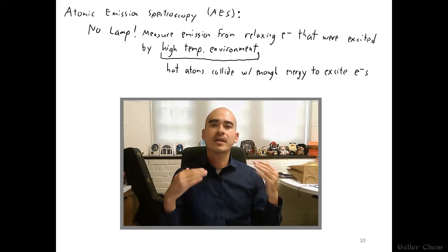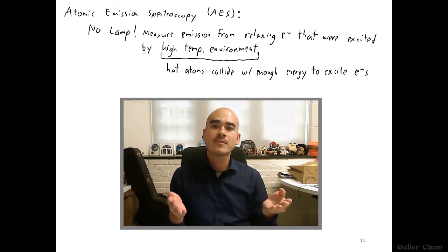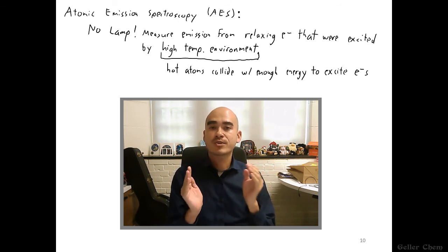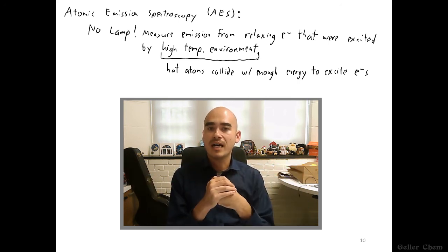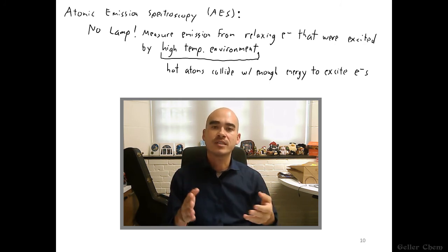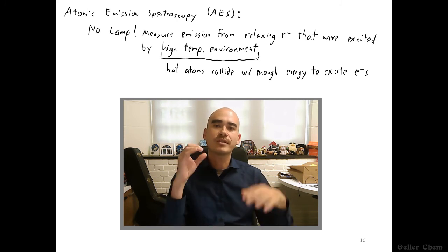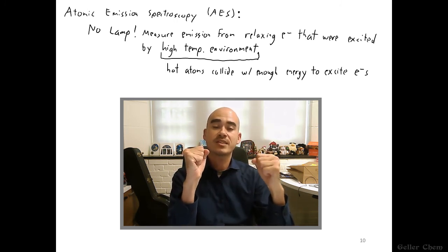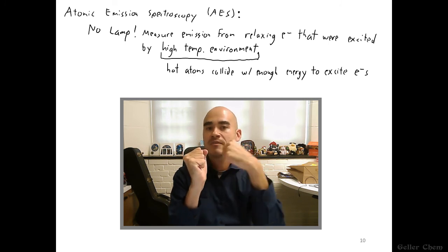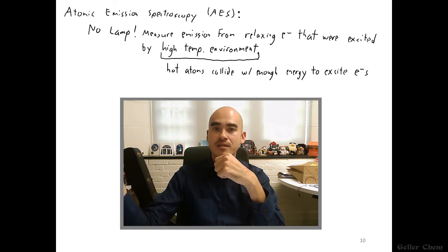Now let me try to explain this collision excitation concept a bit more clearly. Okay, first of all, let's review what type of energy is transferred when two bodies collide. The type of energy is kinetic, right? The energy of motion. So let's start with the most basic problem possible, where we just have two balls, one of them stationary and the other one bumps into it. This ball transfers some of its kinetic energy into this one, and so this one starts to move faster.